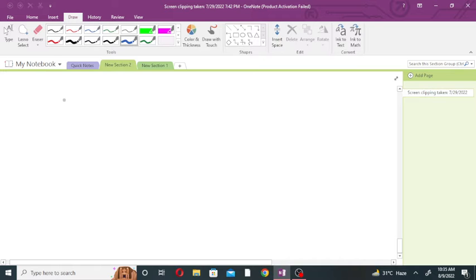Now in order to prepare the molar solution of various acids, for example 1 molar HCl solution, we will use the dilution formula. The dilution formula is M1V1 is equal to M2V2.